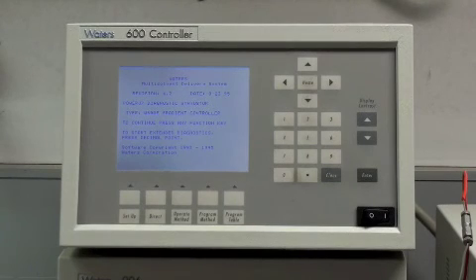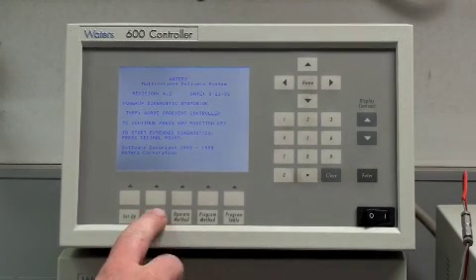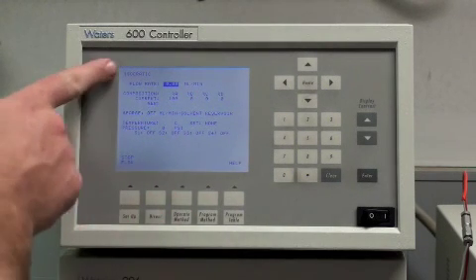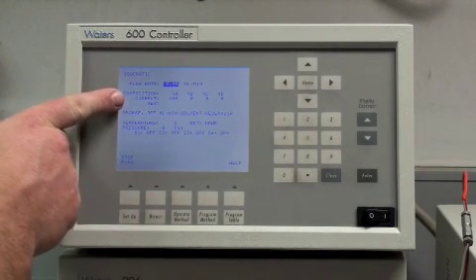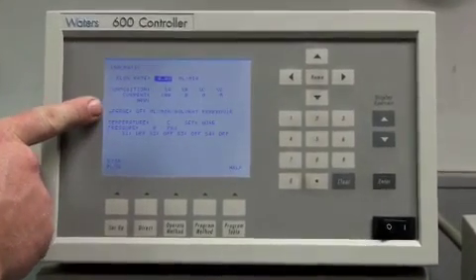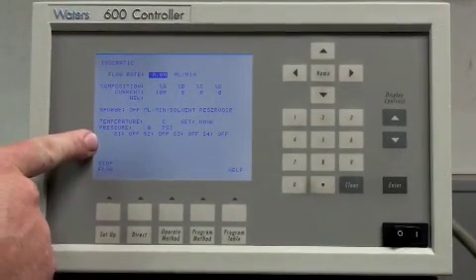You must then choose the channel for the mobile phase you're going to be using. This is achieved by pressing this button here, direct. As you can see here, you've got flow rate. You've got the channels, which is determined here. And this is the information about how the pump is operating.